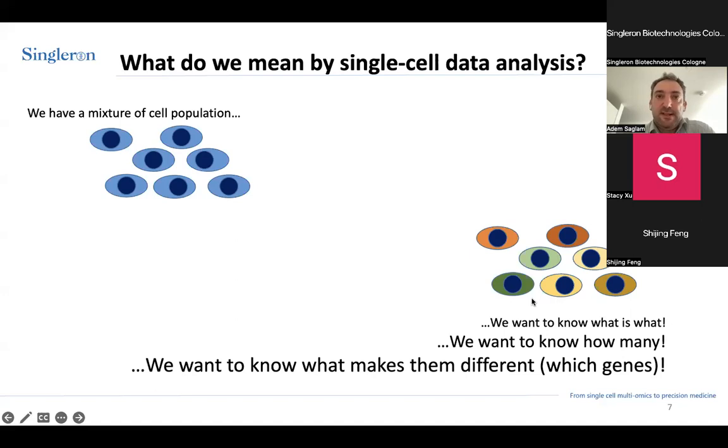By cells here, I don't mean cells of different populations, but for example, let's take the example of the brain again, because I study the brain, so I know this tissue better than any other tissue of the body. So for example, you take the microglia cells, the white blood cells, the resident macrophages of the brain. The microglia can get activated when there is a disease, a neurodegenerative disease. And you want to understand what genes differ, what genes are overexpressed or upregulated or downregulated in this activation process.